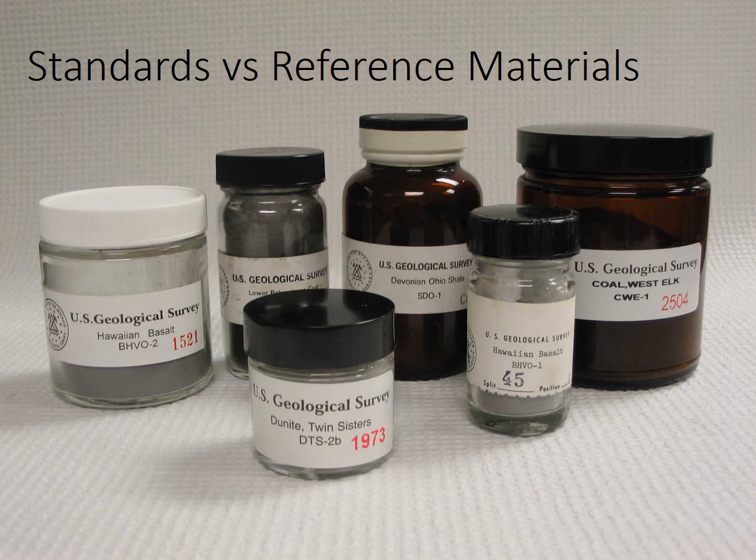So a really important thing when you're looking through geochemical papers, and someone's come out with a new method for measuring, say, unobtainium in bananas, is to ask: have you measured the reference banana? Do you get the right answer?